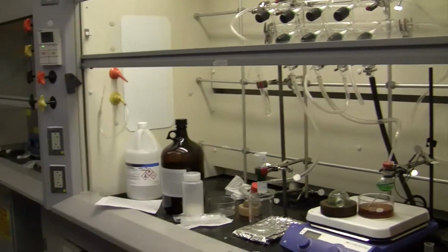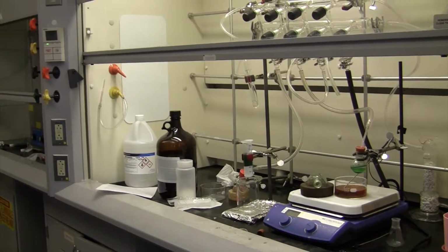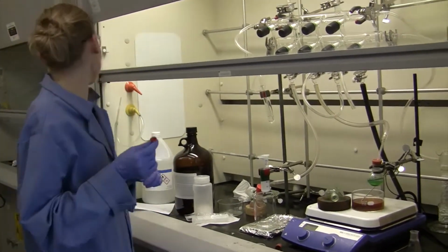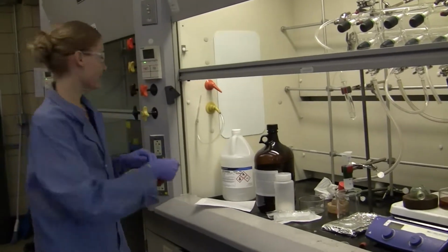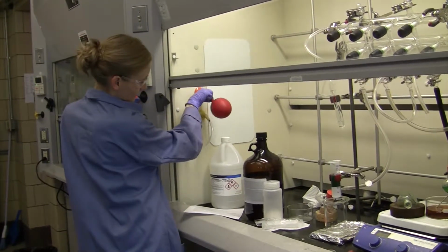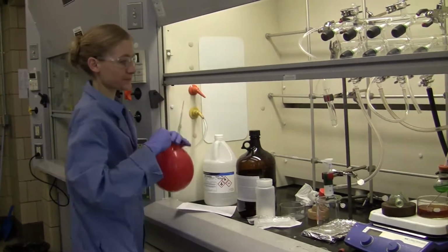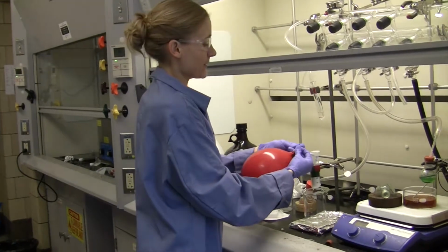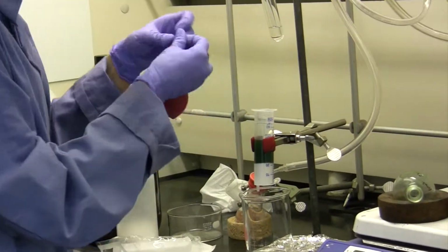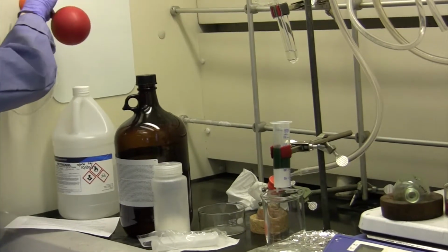There are a few things that you can do. One of my favorites is to use positive pressure. And so what we can do is take a balloon, fill it up with air, and then carefully cover the mouth of the column with the balloon.